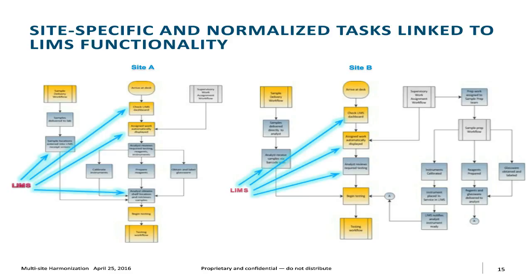So those kinds of things that we can aim at LIMS solving brings the ability of software to do those things that have the most potential for errors and so forth. We always look for opportunities to eliminate errors in transcription. That's why instrument interfacing is so popular, because it provides a mechanism for moving data from laboratory instruments. There's no writing down of the data in intermediate result sheets and those kinds of things. And so that data is moved across into the LIMS automatically. Because we've validated that functionality, that it works every time in exactly a precise manner, we know that we don't have to worry about it anymore.